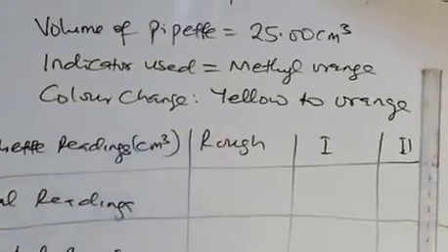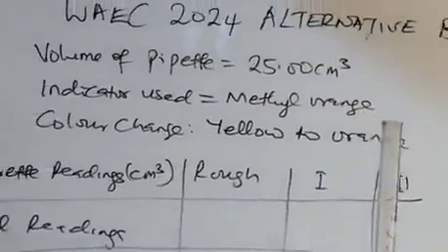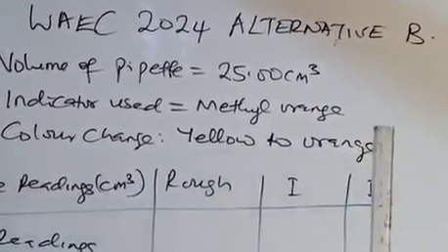The rough, the first, the second. You can also do the third one if you wish, but if you do 1 and 2 and are consistent, there's no need to do the third one. So let's go to the question right now and start the experiment.